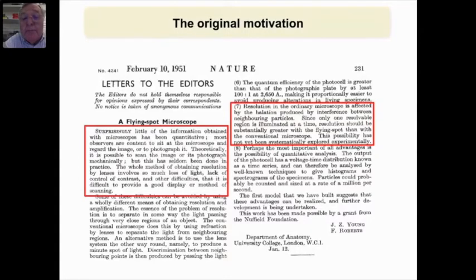Their point number 7 was one which got us particularly interested, where they say that the resolution in the ordinary microscope is, well, they use the word halation, produced by the interference between neighboring particles, but they claim that in a scanning microscope, since only one resolvable region is illuminated at one go, one ought to be able to improve the spatial resolution. This possibility has not yet been systematically explored experimentally. It now has. So this is really what fired our imagination to start off with.